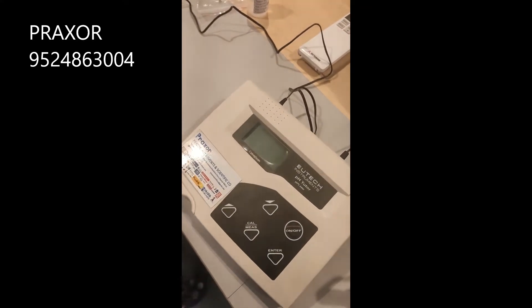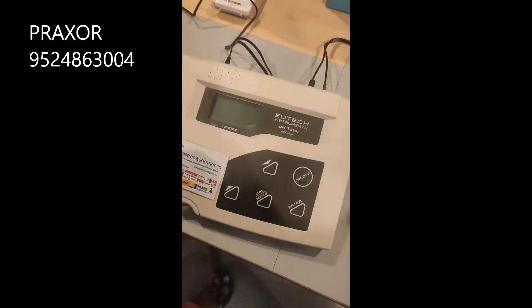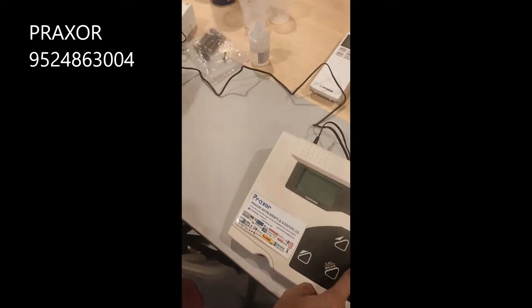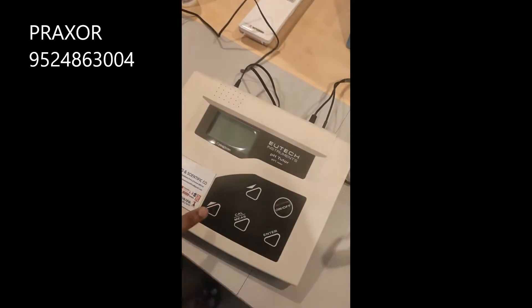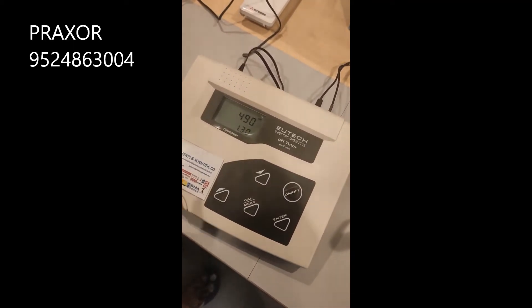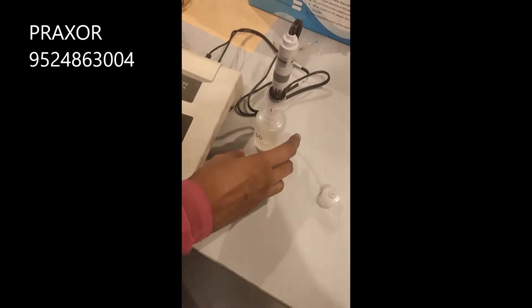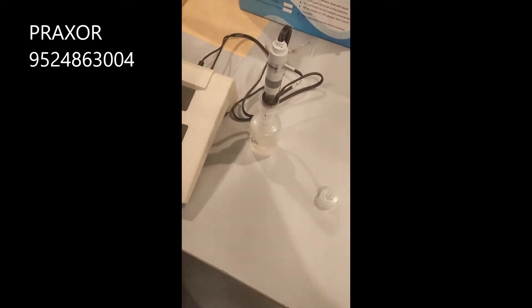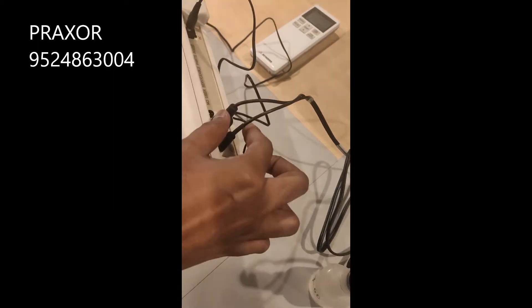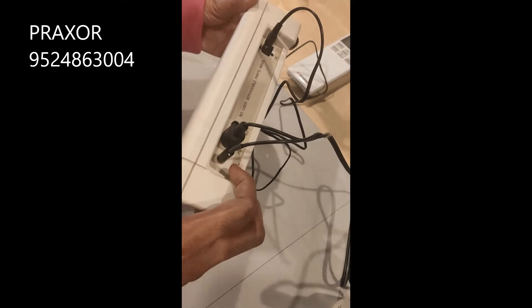Demo video for UTECH pH tutor. First, switch on the instrument. You can keep the pH calibration solution 7.00 ready. Connect the ATC electrode — the back side connector is for pH and this is for ATC.